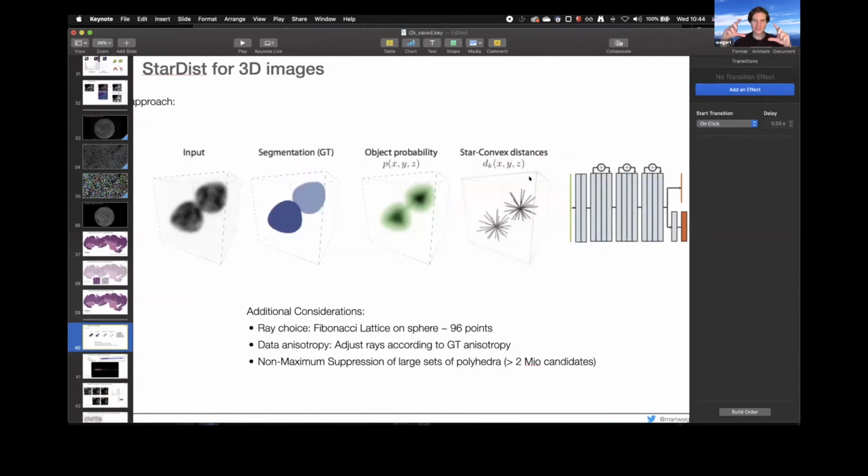What we typically do is not scale anything of the stacks. Maybe we should, but we don't do it now. So we keep the raw images and you predict on the raw images. Imagine your raw images have 5- or 6-fold less resolution in Z. If you have perfect spheres, they would look like prolate, compressed objects. And of course, if you then just use normal rays that are equally distributed on a normal sphere, they would miss a lot on the side. That's what I mean by anisotropy.